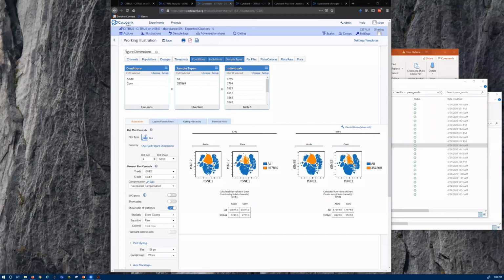Perfect. Thank you so much. I'm just going to take one last question, and this is the simple one. Is there a cap in terms of the number of total events one can run using Citrus? And I'm going to get Steph to answer this.